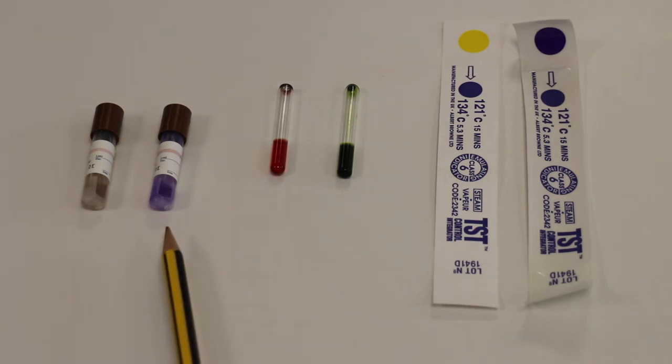If the autoclave process has been successful, then the spores cannot germinate once media is released over them. But if the autoclave hasn't worked, then the spores germinate and the media changes color, it goes to a yellow color and it's also cloudy.